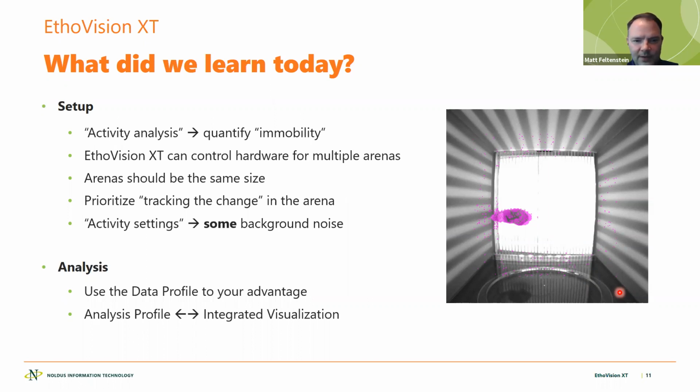This is not just for fear conditioning, it's for lots of other studies, just to make sure things are working the way that you wish. So use those in tandem, back and forth, to make sure things are set up the right way, to make things easier for you.